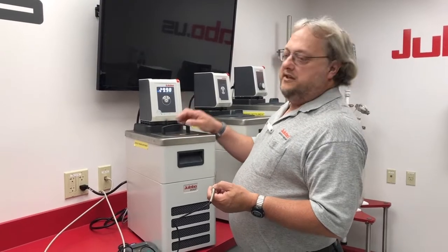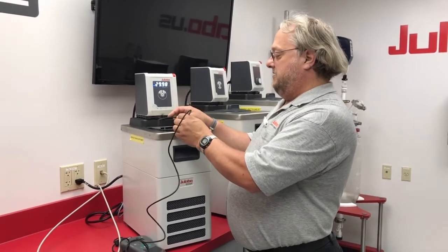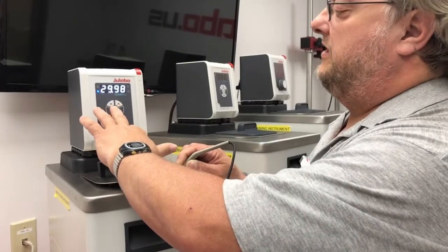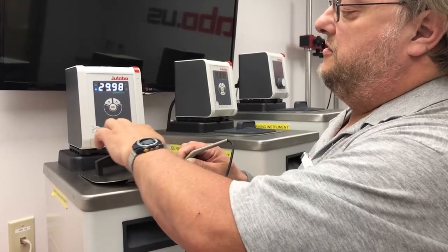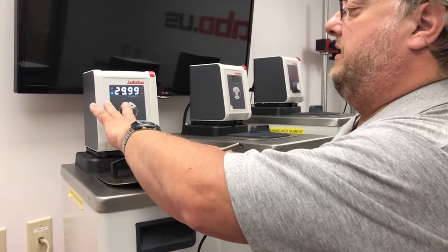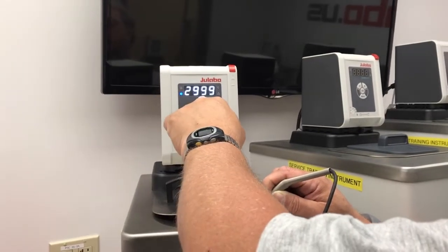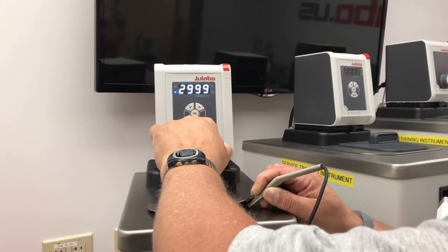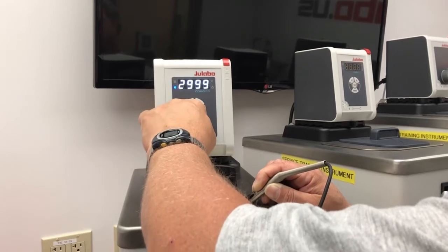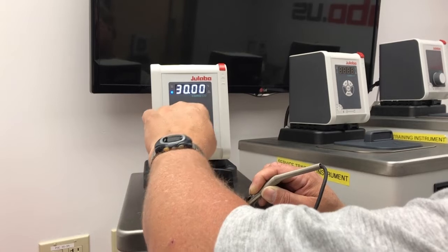When your unit gets to near the set point, take your calibrated thermometer, sit it in the center of the bath, and press the down arrow key and the service key — which is in the lower right hand corner of the keypad — at the same time, until the period flashes. Then you can enter your corrected temperature from the calibrated probe.